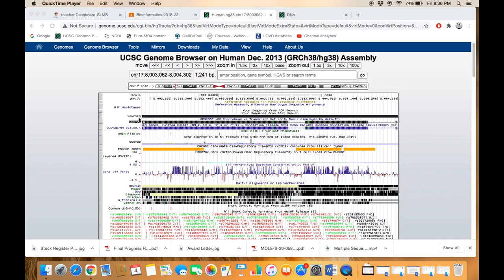The sequence that you just pasted in the query box of BLAT is graphically represented as 'Your Sequence,' and you can see that it is represented by a solid black line.